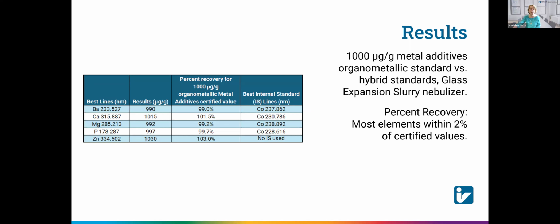I will mention this again, but just like in normal real-world labs, oil testing, no matter what the concentration of the sample, those samples are diluted 1 to 10. We did that also with all of these standards. So no matter what their concentrations, we diluted them 1 to 10 in our solvent.